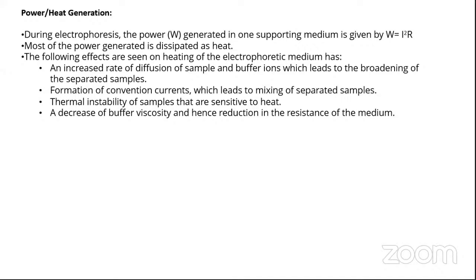That adversely affects the mobility of your molecules under the effect of the electric field. The reason is that buffer ions are very small. If you compare the proportion of charge to mass of buffer ions with your molecules, which has a greater proportion of charge compared to the mass value?